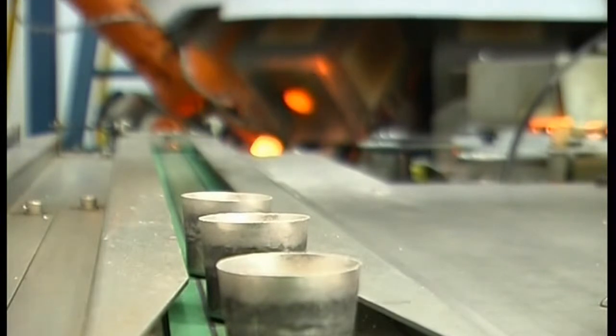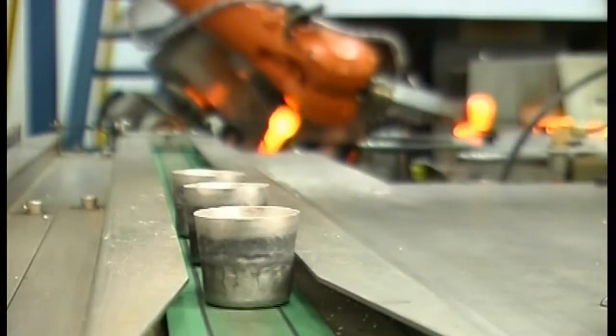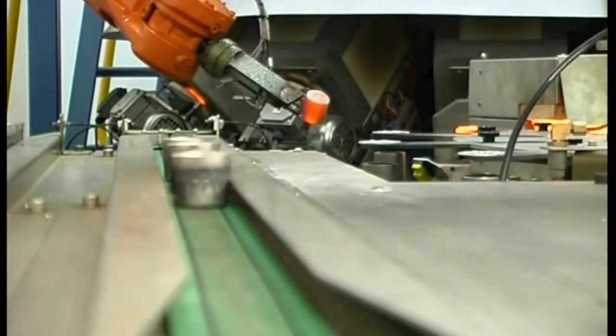Sample contamination is minimised because unlike the manual system, the furnaces in the robotic cell are enclosed, so exposure to airborne dust is minimised. Better quality beads mean better quality results.